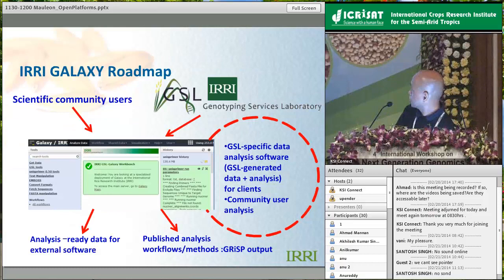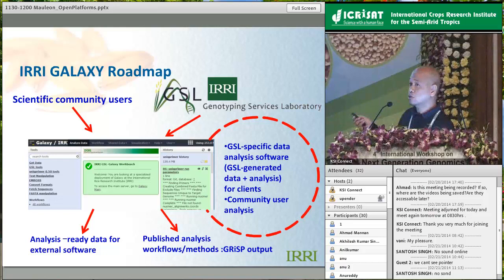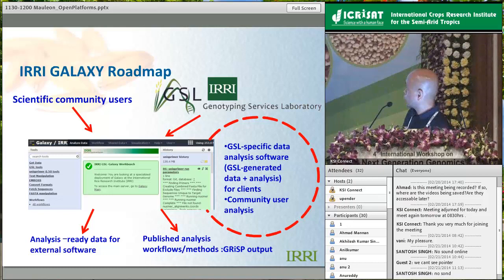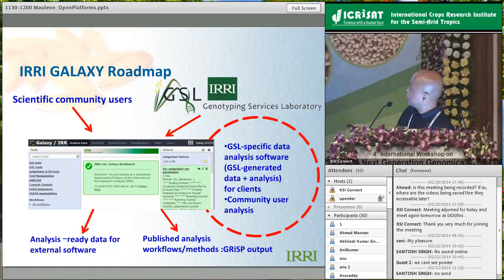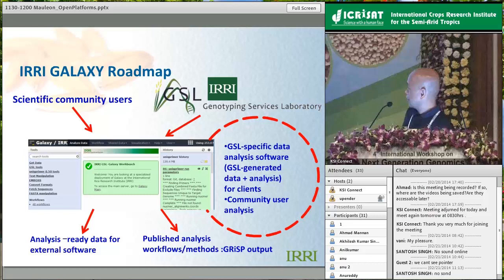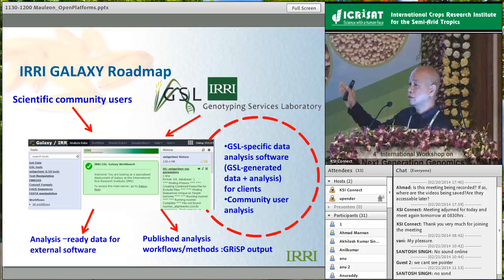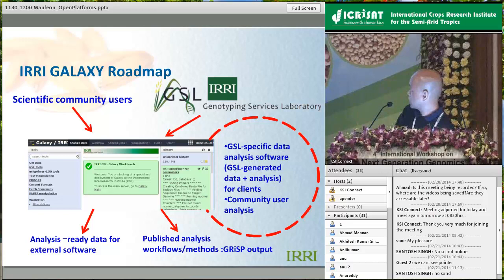The tools shown before are already available in a prototype tool shed. The roadmap for IRRI Galaxy envisions it first serving the genotyping service lab - from data generation it can flow to IRRI Galaxy as a shared data resource where all analysis can be done as a GSL client. It is also by default open to scientific community users who are not GSL customers. The output can be data ready for analysis, or you can publish your analysis workflows supporting your manuscript publication. We are working towards IRRI Galaxy delivering on all those features.